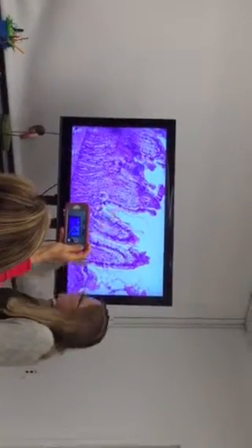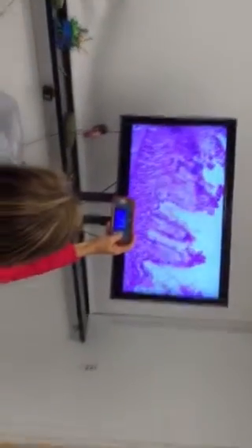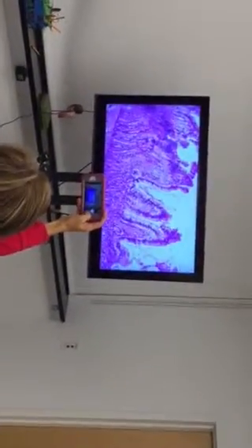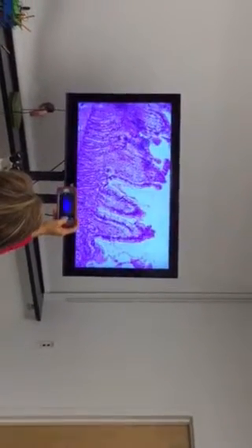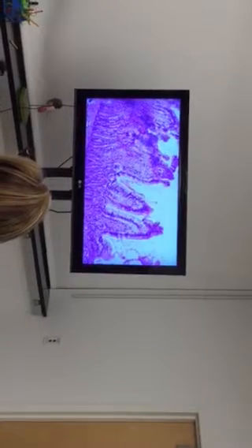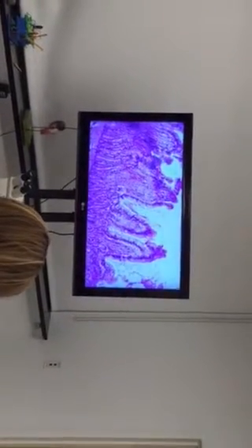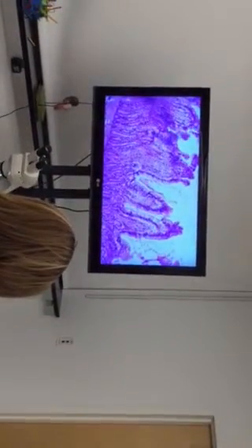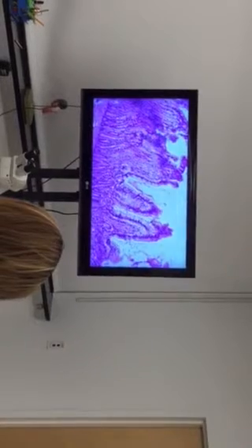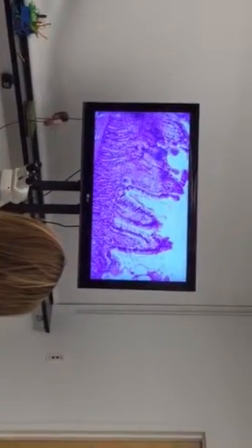And I'll show you the more zoomed in, the higher magnification with the blue stripe. Okay, the 400 times here coming up. But each villus, each finger-like projection, the wave, is surrounded by simple columnar, okay? The villi need more surface area because the small intestine sucks up the most nutrients. So the pancreas releases enzymes into it, digestive enzymes, and simple columnar cells suck those nutrients up.